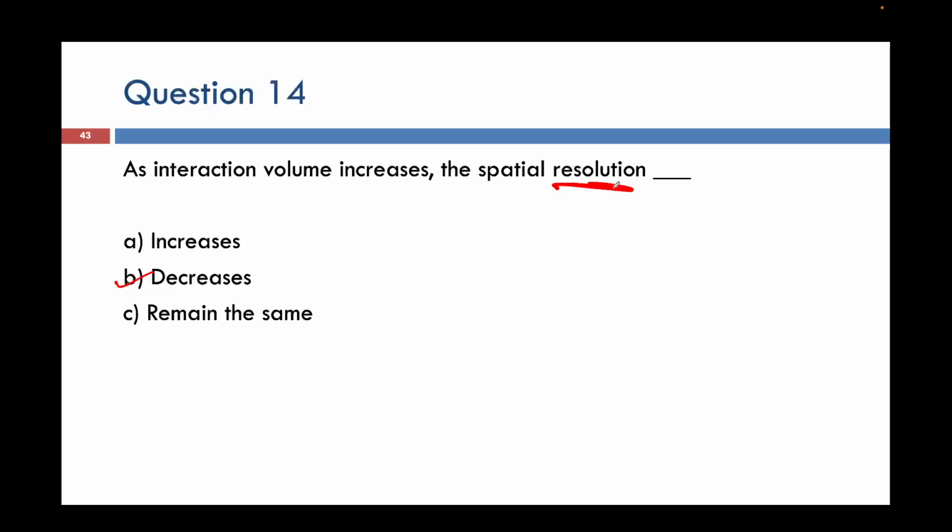But the resolution means the electrons will have a particular energy, right? So the energy graph, if you see, will be like this. The loss of energy for a particular beam of electrons will happen, and if that happens, then the resolution will decrease. You might be getting a good amount of area to scan, but I'm talking about the resolution.